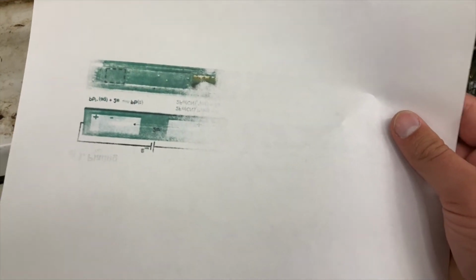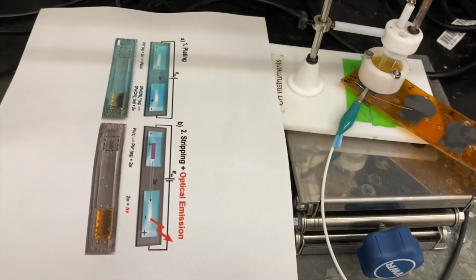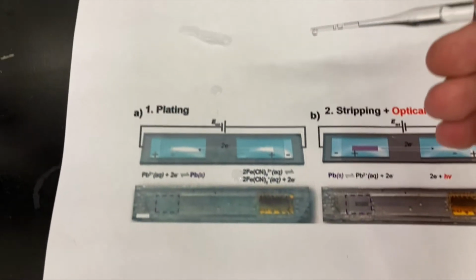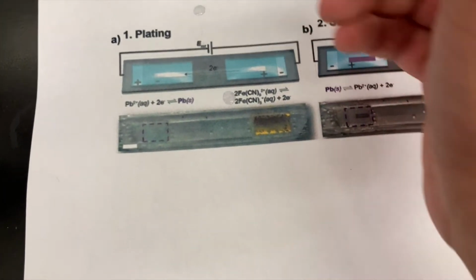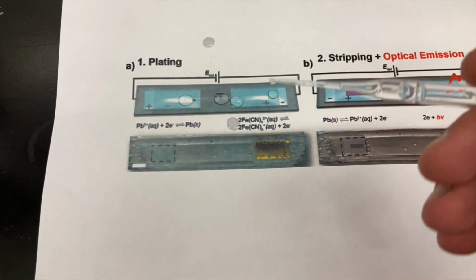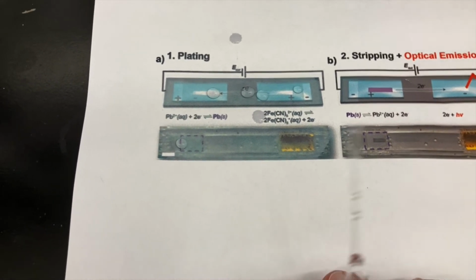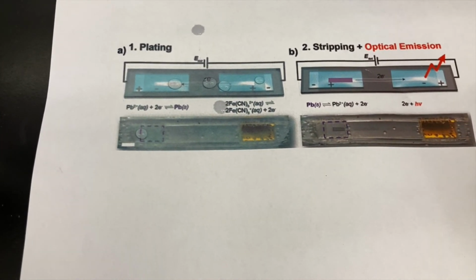So as you can see, we're not quite done yet, but the wax has certainly started to set in. I'll leave that on for just a little while. Alright, so I've got that pulled off the hot plate, and now you can see if I drop water up here, it's going to sink into the paper a little bit, but if I drop some water on top of the wax, it beads up really nicely. And it'll do the same on both sides if you let it set into the paper like that.